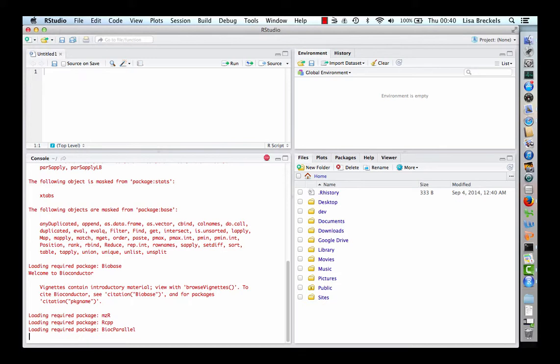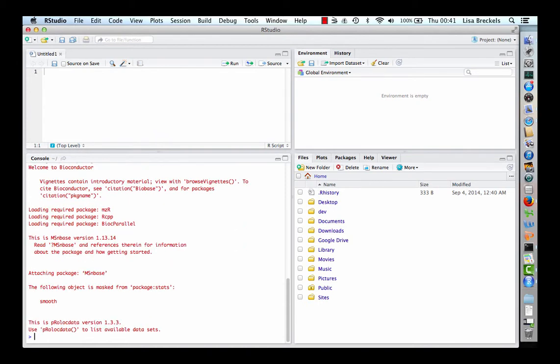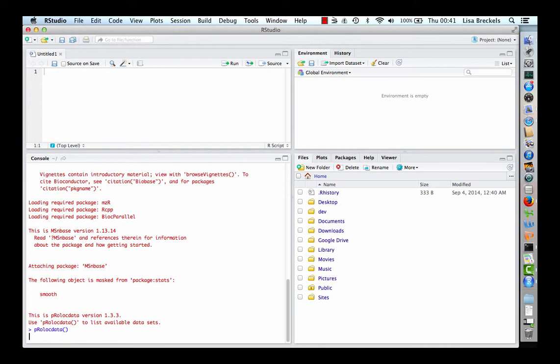As previously mentioned, pRolocdata contains a number of datasets from a range of different quantitative proteomics experiments. To list the available datasets, type pRolocdata followed by an opening and closing bracket.